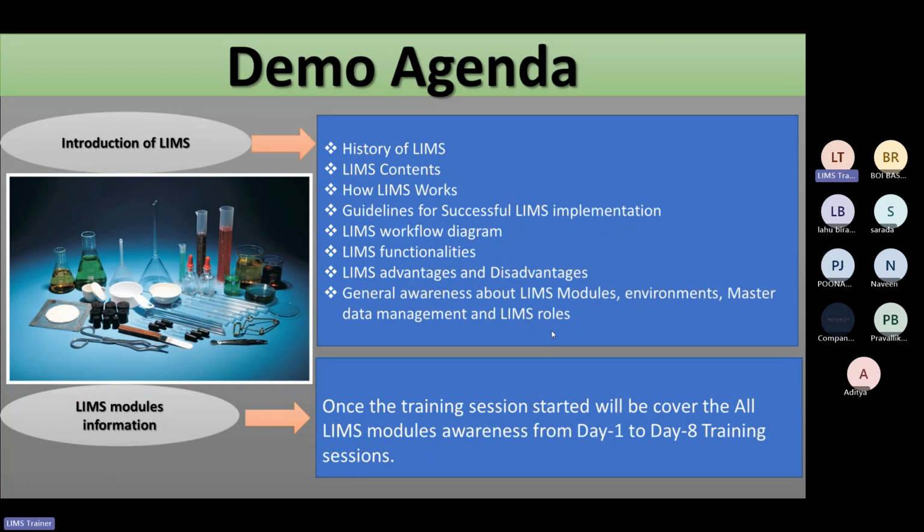But I give you the assurance that after completion of the course, you will be eligible to work on the software. Even though I am explaining with the Labware LIMS software, you will be eligible to work on other software also, as many other LIMS software are available in the market. Why is it possible? Because the modules are 90% the same. You will find plus minus 5% differences, because of the design of the software. Whatever the regulatory requirements are, according to that all the functionalities will be available with all the software, so it becomes easier for you to work on that particular software.